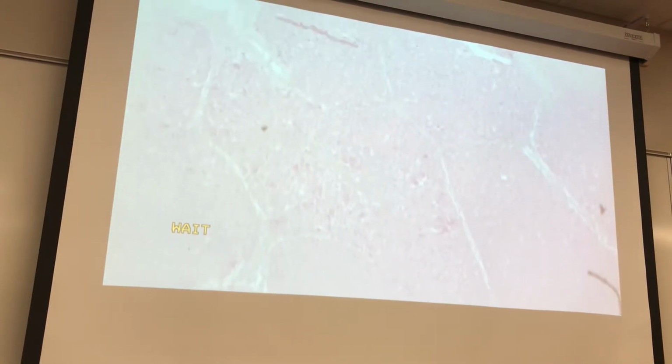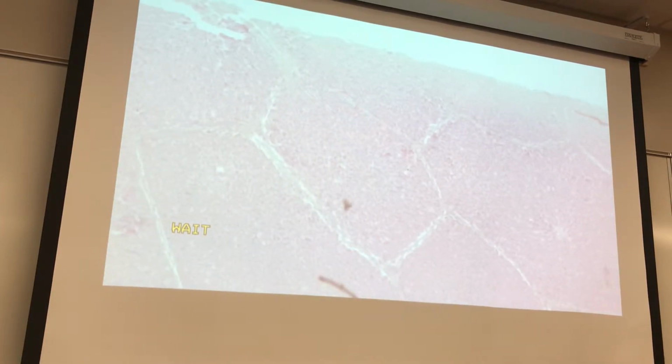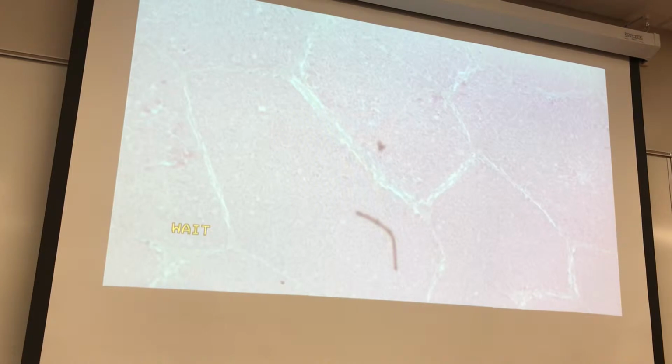There's only a few things that you can highlight in liver. Get it in a little bit better focus. This is a lightly stained slide. It's going to be hard to get it into good focus, but we'll try that. So I look around in here. Here it is.